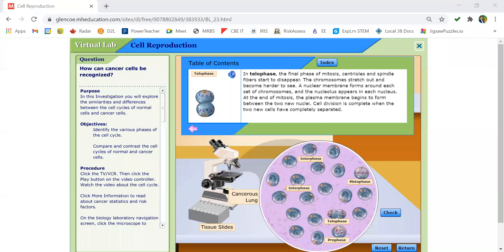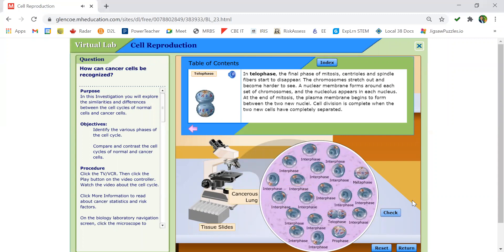Now let's look at a cancerous lung cell. I've identified three of the cells as interphase because we can only see their chromatin. One cell is in prophase, another is in telophase, and another is in metaphase. Pause the video now to record the number of cells in interphase as well as the four stages of mitosis.